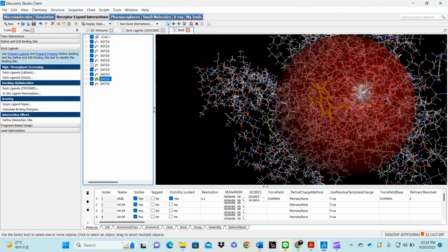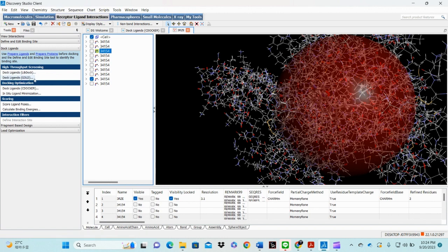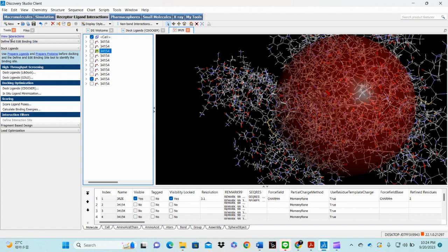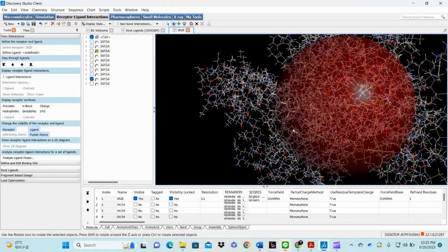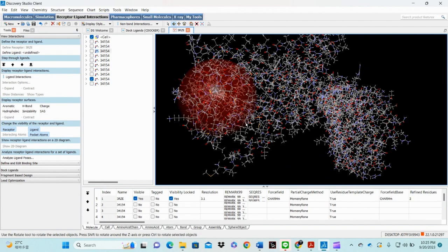We can choose one of the molecules and see its 2D interaction with our active site. In Discovery Studio, you can check the view interaction — just click on the molecule and we can check how to see the 2D interaction with the receptor molecule in the active site.